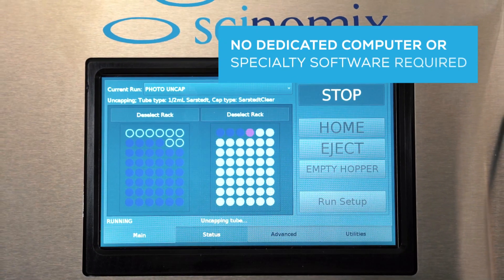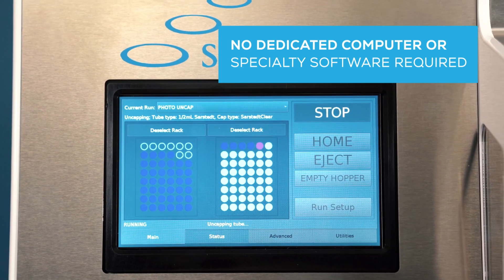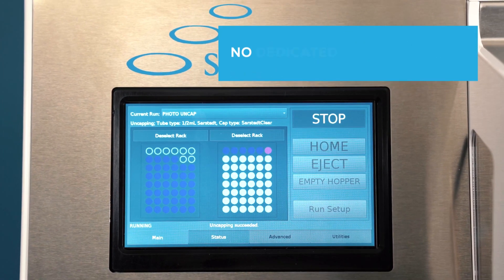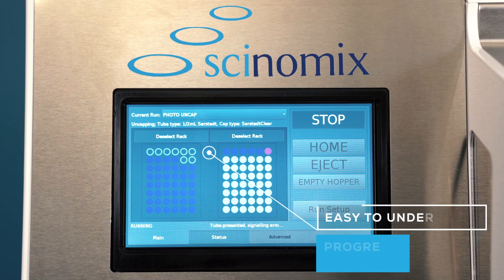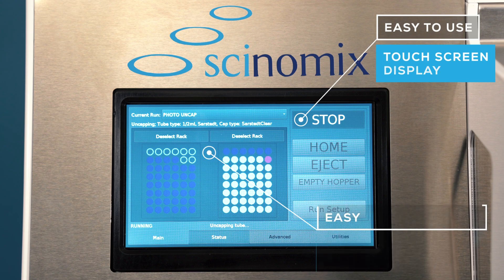No matter the application, the RapidCap2 benchtop system does not require a dedicated computer or specialty software. The convenient touchscreen display provides all the information needed to operate, including progress updates, quick commands, and a wealth of additional features.